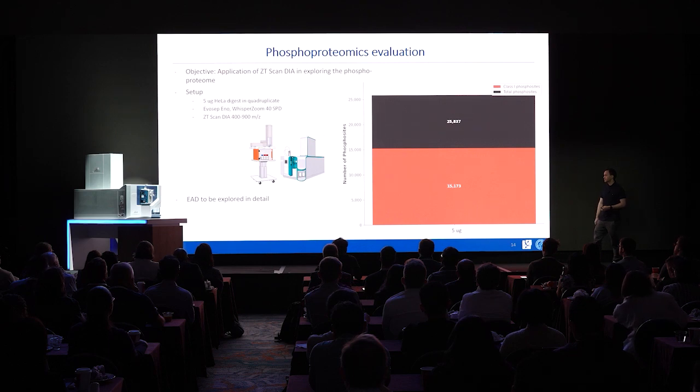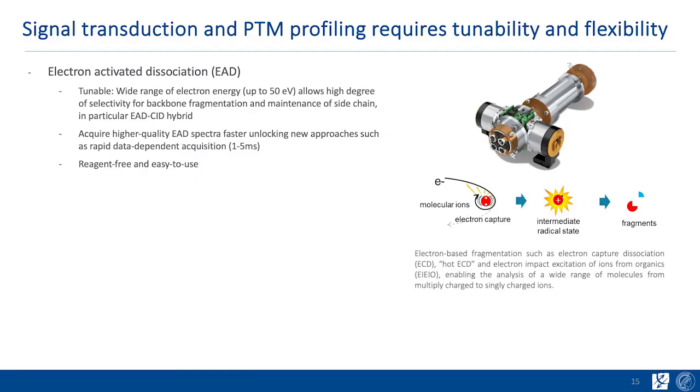So the question is how much more information we can get with this, and since this instrument has EAD, it's very well set up to explore this in detail. We've just started doing this, so I'd like to briefly explain why EAD is good for doing PTM analysis.